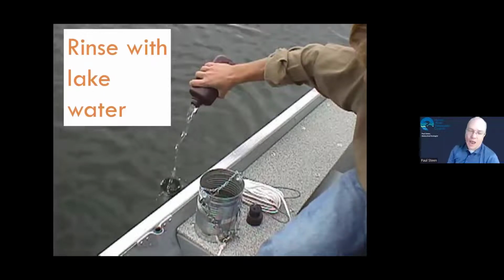Okay, so we're out there on the lake. We've determined that depth that we're going to use. And this is where you deconstruct your sampler, and you are being careful to not dump your weights overboard or dump your sampler overboard, but you do take out that big amber vial and you rinse it a few times to make sure there's no residual dust or water from last time you did this. So you clean that out, and then you can reassemble the contraption, and you are ready to go.